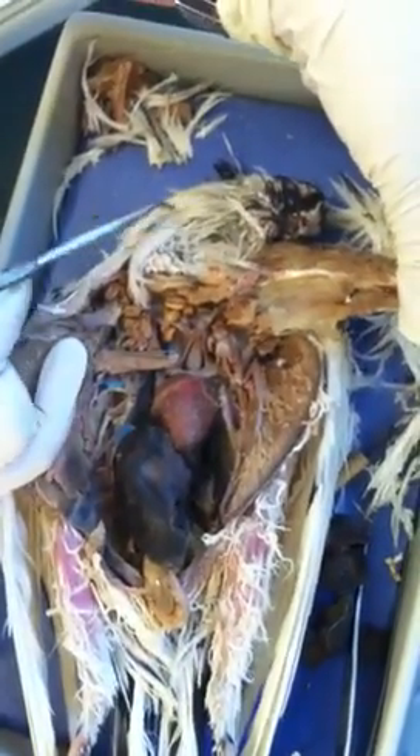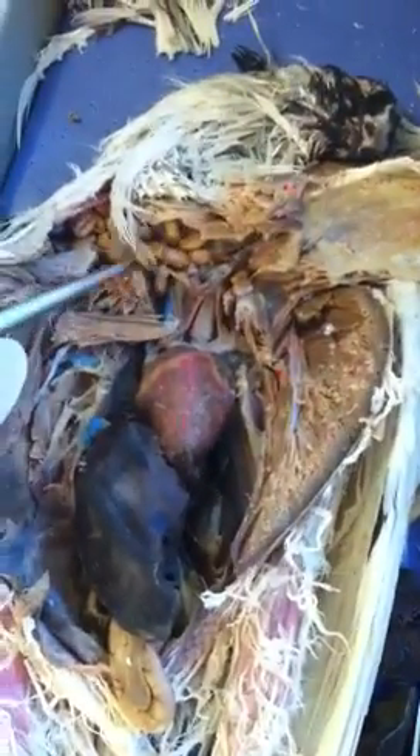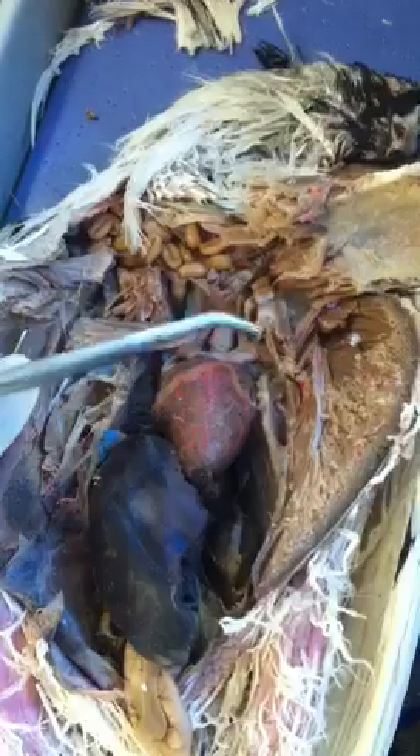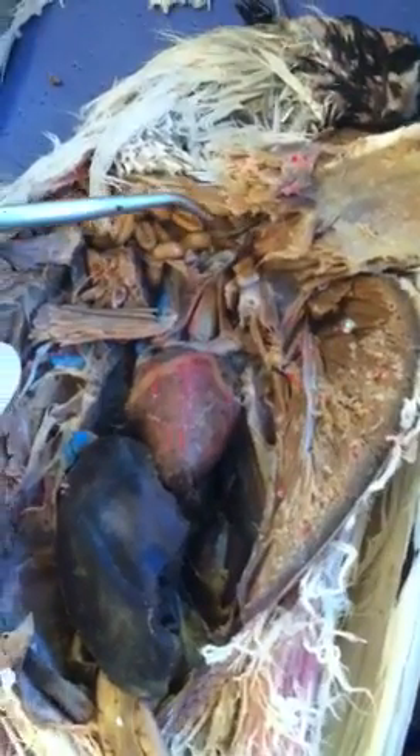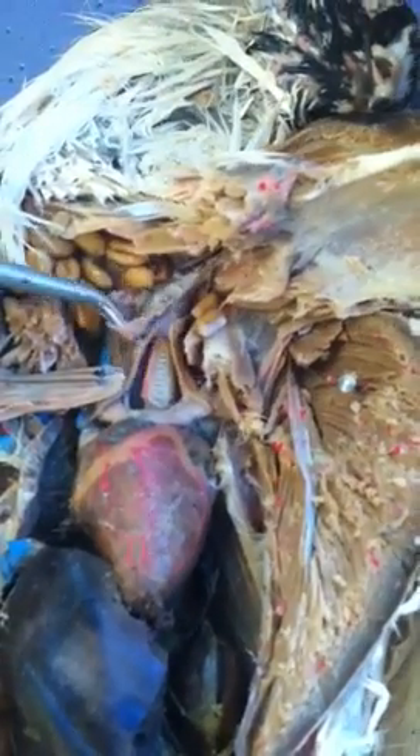This is a dissection of the pigeon. In the neck region you will see a sack-like structure with seeds and food in it — that's what we call the crop. Going along with the crop you will see a tubular structure; that's the esophagus. Just remember, the esophagus is attached to the crop.